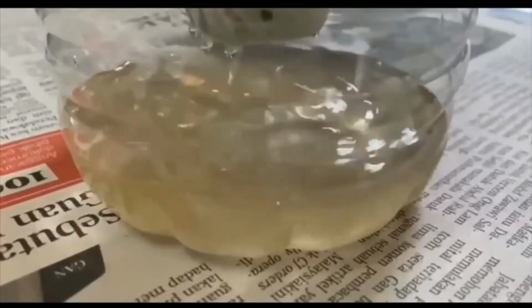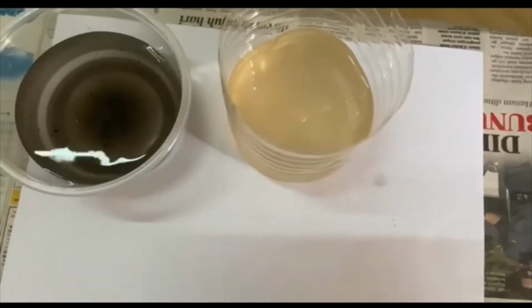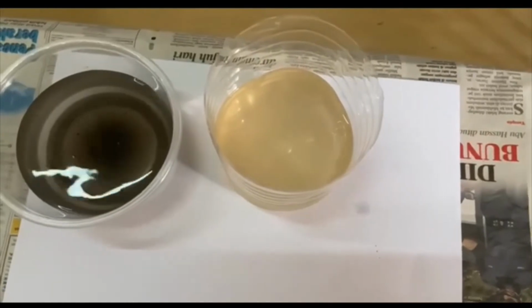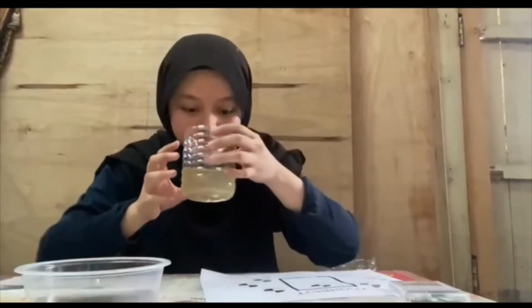This is the water coming from the water purification system, and this is the final look of the system. Here you can see the differences in color between synthetic water and wastewater. So here is the testing of the odor for synthetic water and wastewater.